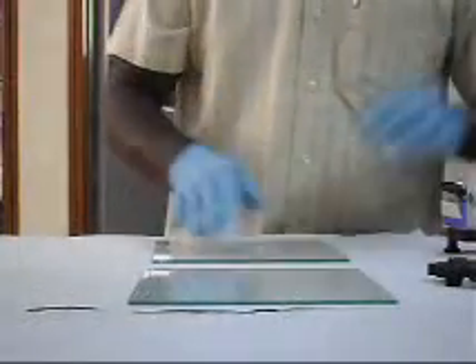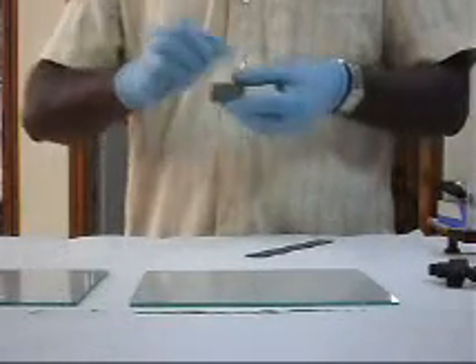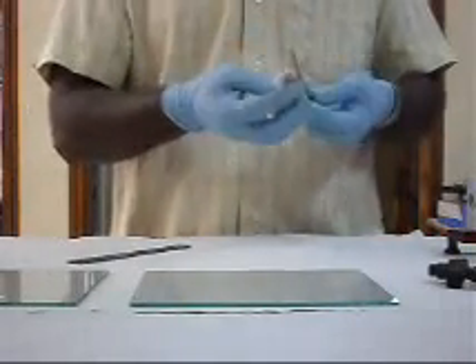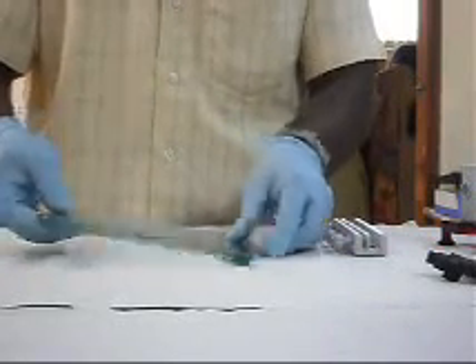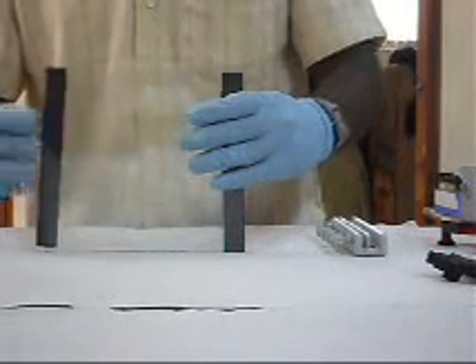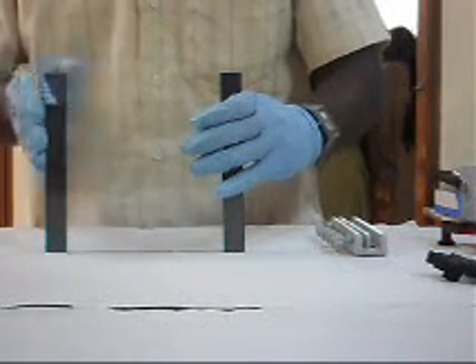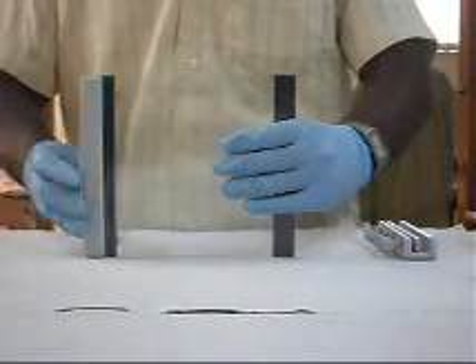The gel glass plates, spacers, and combs are cleaned thoroughly with water and then with 70% alcohol. The spacers are kept at the sides between the two glass plates. The plates are sealed at the bottom and at the sides with clamps.